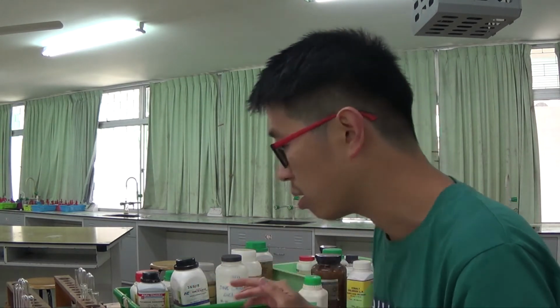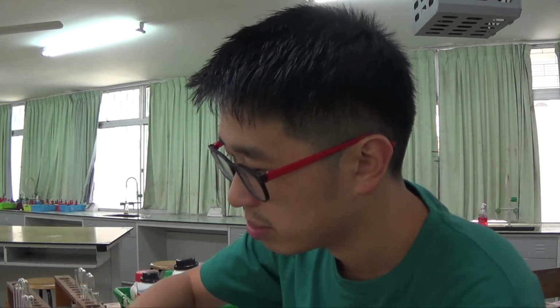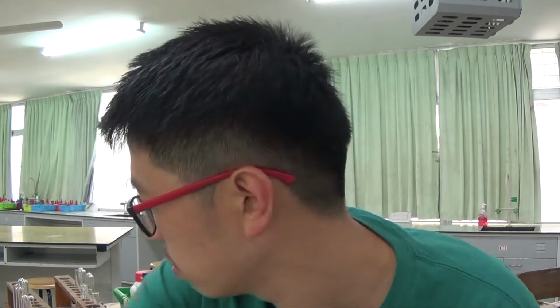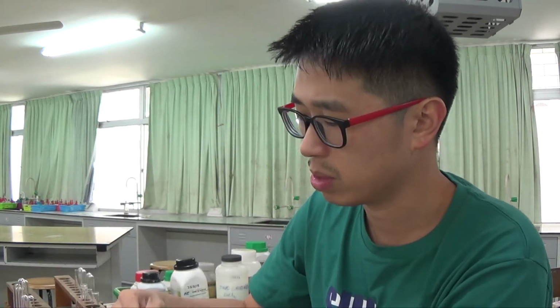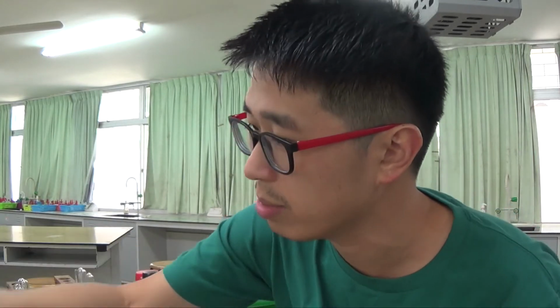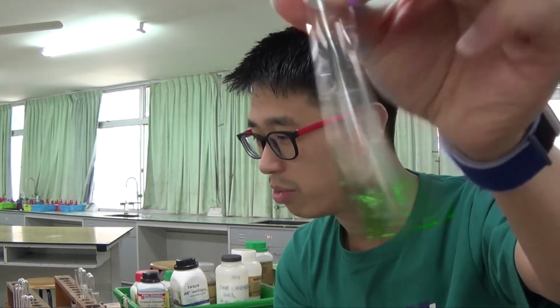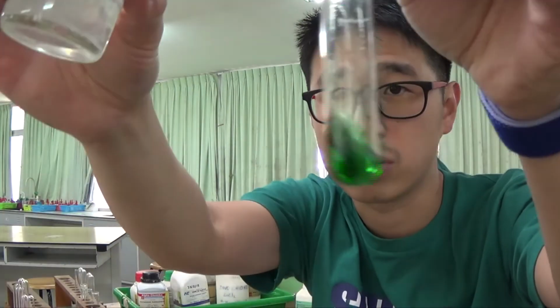Where's my chromium 3 chloride? Here it is. So I don't reuse my spatula, I use the other tip which is clean. So I have a larger spoonful here. By the way, chromium 3+ I think is okay because it's in the syllabus. Chromium 6+ is carcinogenic. So here the solution is a lot more concentrated, right? Let me add a little bit of sodium hydroxide to this.